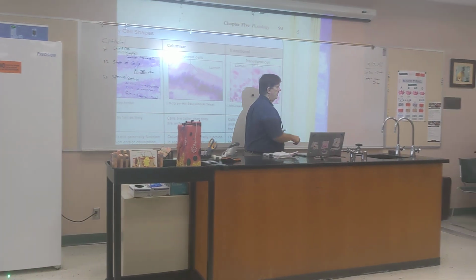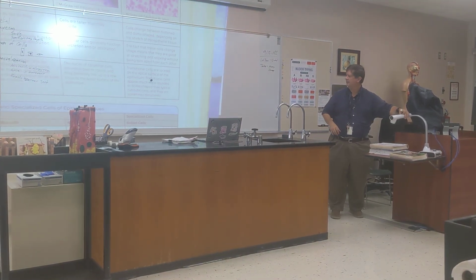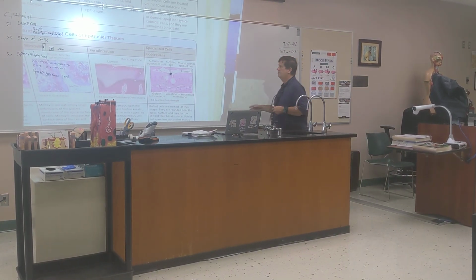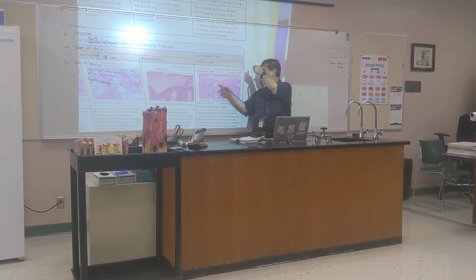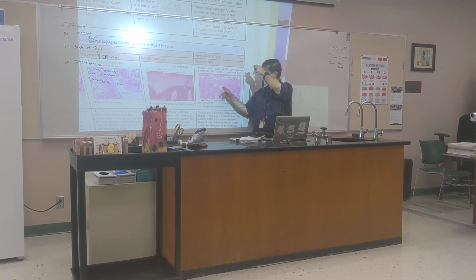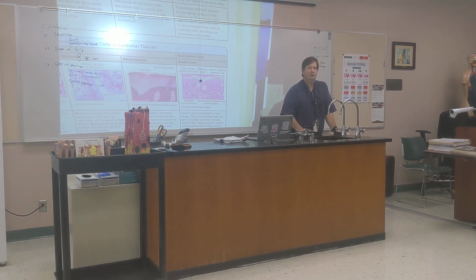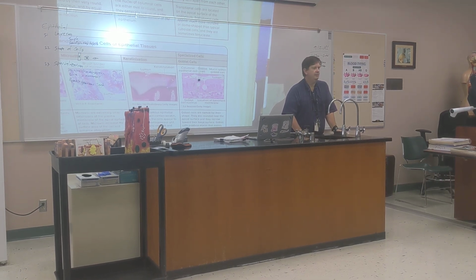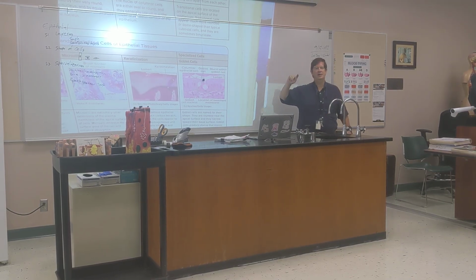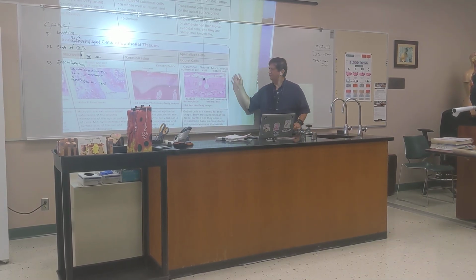Let's see what other one they had in their 5.3. Oh, goblet cells. Yeah. Okay. So, goblet cells here. These are special. They are weird. They're easy to spot on most microscope slides because they stain really, really pale. See the opening to the outside, the opening to the outside? Those are mucus glands. They are single cell glands. They're one cell that is capable of making mucus. Let's say another way, that's not true. They're capable of making the protein mucin that when it hits water, when it leaves the cell, it becomes mucus. Are we good? Does it make sense? Okay. So those are the specializations they had there.